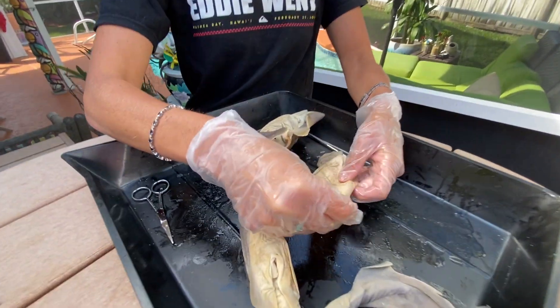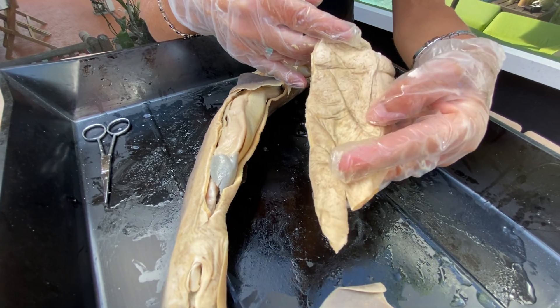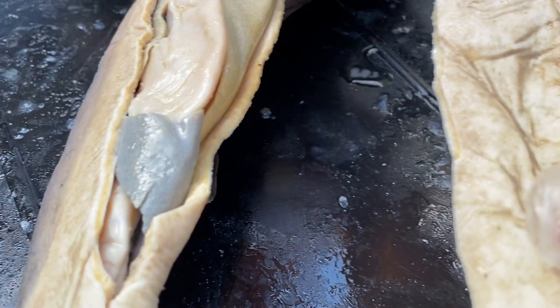I have already removed part of the ventral side of the stomach region. Just a cool fun fact for you guys — because the placoid scales are so rough, this actually used to be used as sandpaper back in the day.